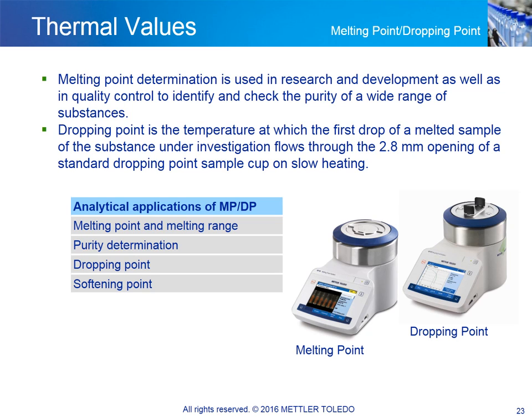Both the melting point and melting range evaluations are performed according to the pharmacopoeia guidelines. Since the melting point of a pure substance is highly dependent on its purity, the measurement can also be used to evaluate the purity of chemical substances.